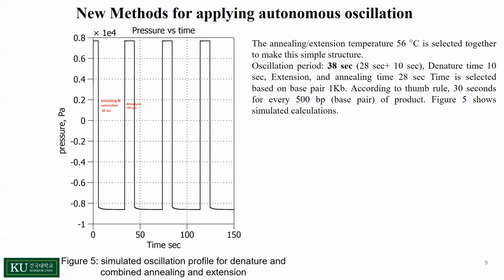How can I change it? I change the periodic resistors left and right to 2 different values. For this reason, one half, when pressure falls, is 30 seconds, and one half, when pressure increases, is 10 seconds. This way, I designed the oscillator, which I described at figure 2, the previous figure.